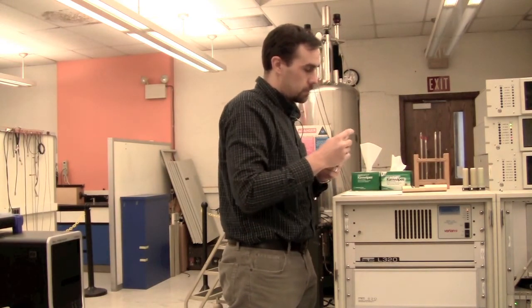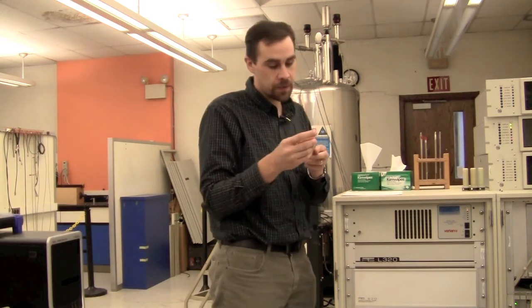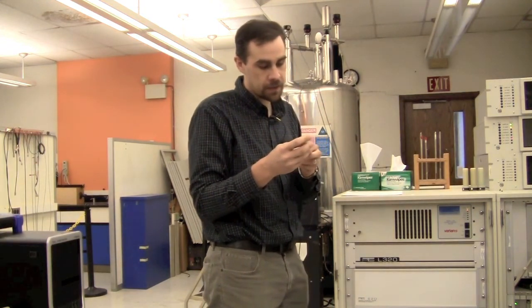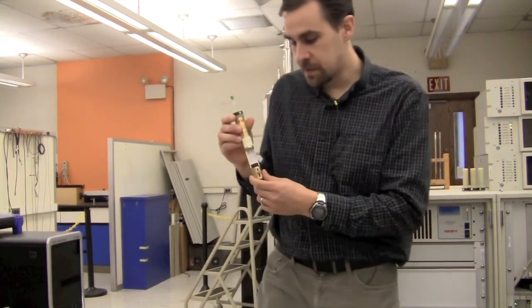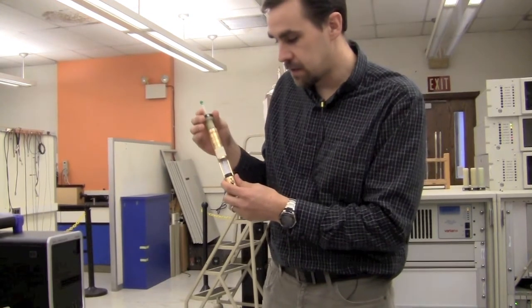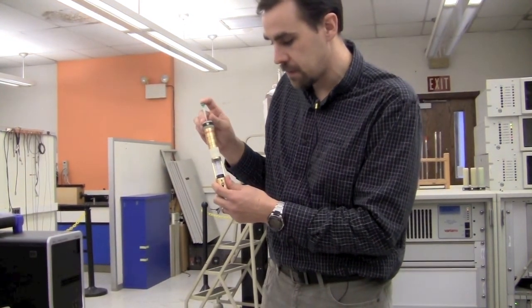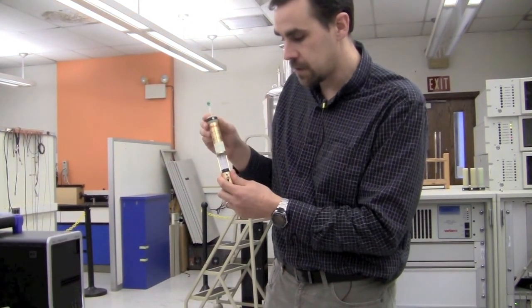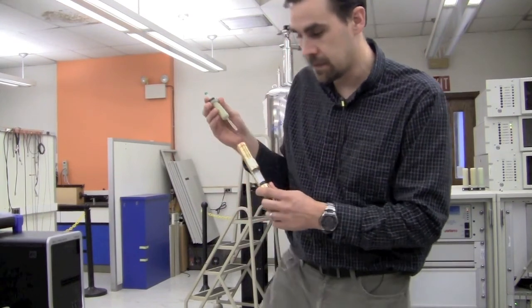Put back the dummy sample. Remember the reason we have the dummy sample is that if nothing ejects, don't put your sample in because there might be a sample stuck in the magnet. The main cause of samples being stuck in the magnet is them not being set to the right depth. So make sure that when you put the dummy sample back in, you put it at the right depth.